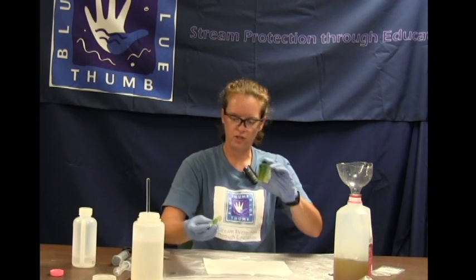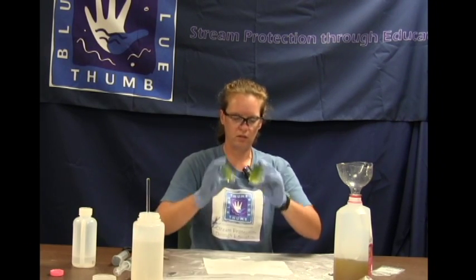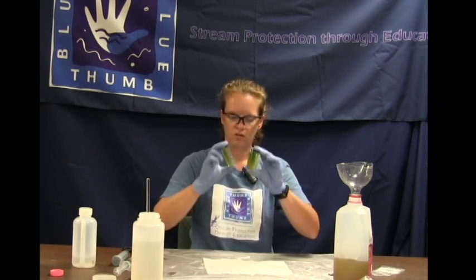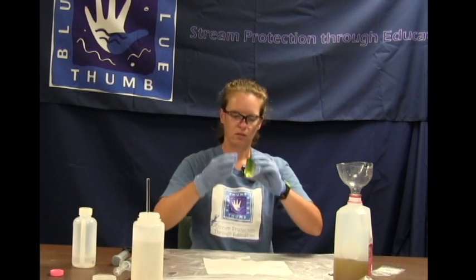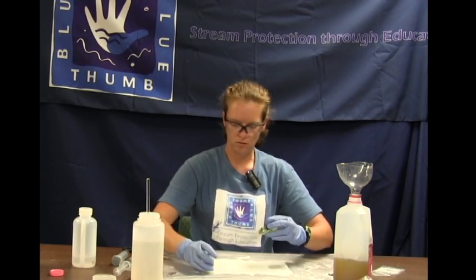And we're going to agitate the cubes back and forth until they are dissolved. This one will take a little bit. The reagents have quite a bit in the packets. There's not much liquid in these cubes. So just keep inverting back and forth until they're dissolved. Okay, those are dissolved.